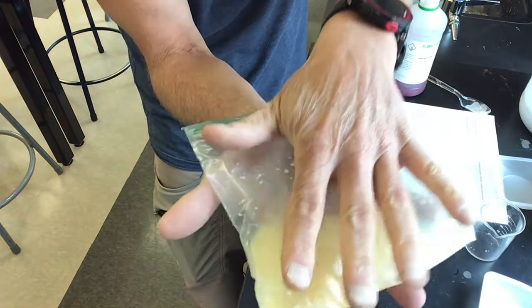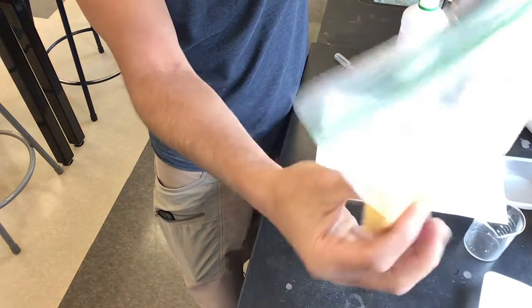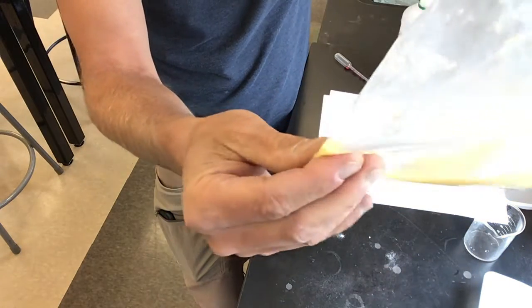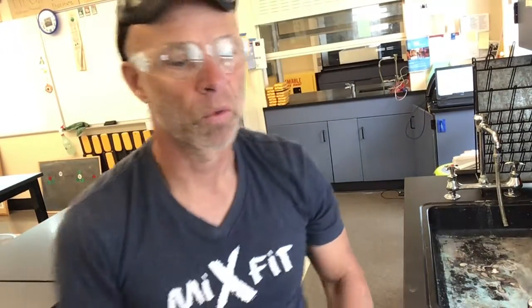You can see that there's a gas in there. And like I said before, the temperature is warm, and the red indicator solution went yellow. You also notice that the water dissolved both solids. I don't see any solids left in the bag. So that's research questions 1 and 2. Like I said, you will be doing a bunch of trials with all these chemicals, and you might even look at trials of individual chemicals to see what role each of them plays.